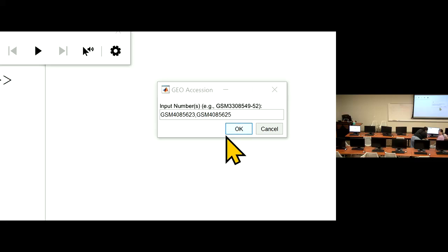Yeah, so this is a network issue, and recently it's not so stable. If you have trouble, you can just download the one I prepared for you. My machine, let's see whether it can go through. The NCBI database sometimes is not so stable recently.